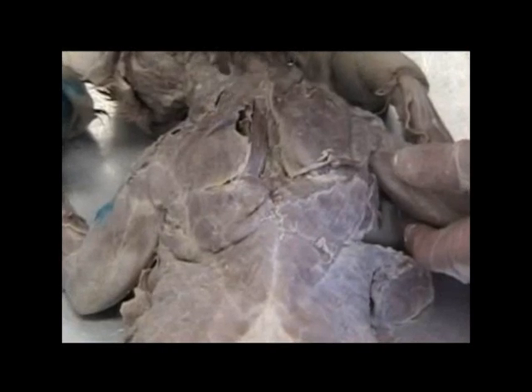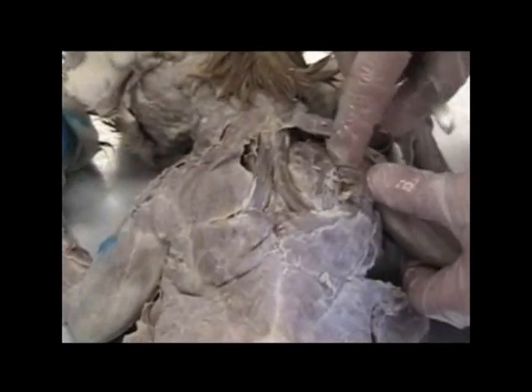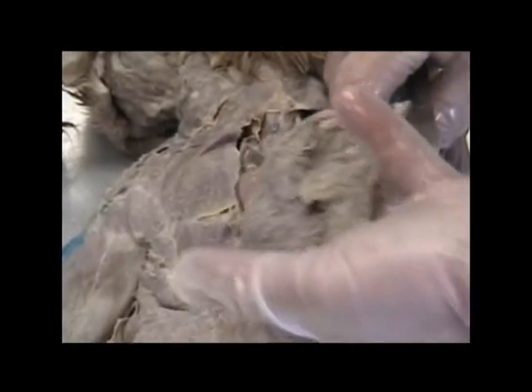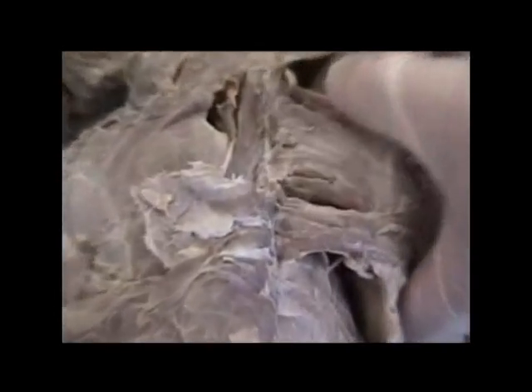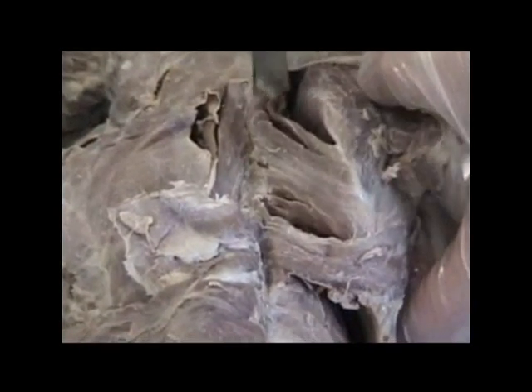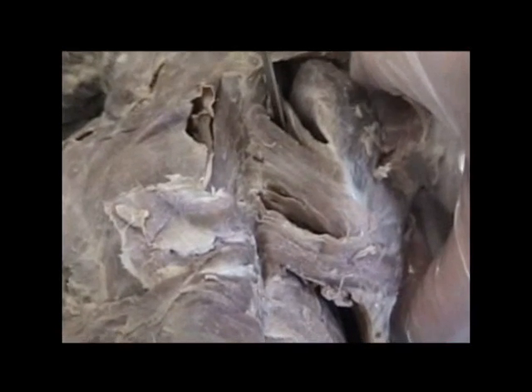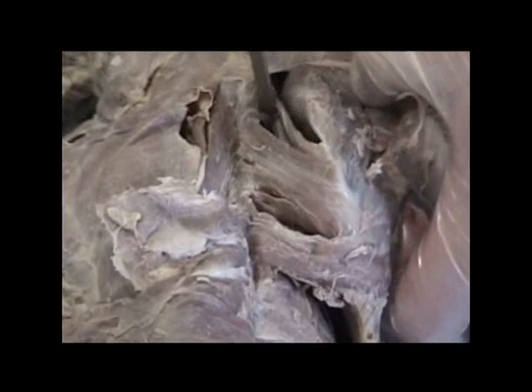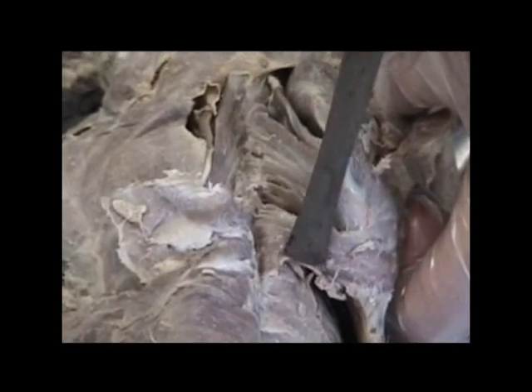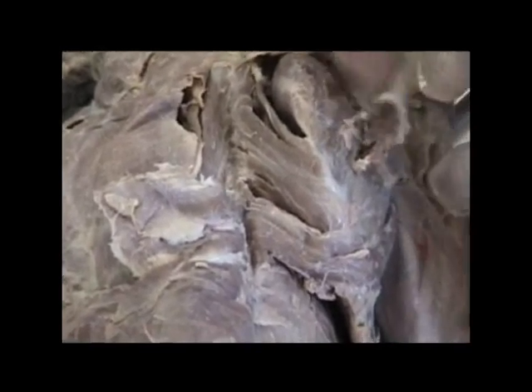I'm going to move to the deep shoulder, and we're going to reflect back the acromiotrapezius as well as the spinotrapezius and latissimus dorsi. And we can now see a distinct group of muscles called the rhomboid group, or the rhomboideus. And there are three divisions of the rhomboid. The most superior is the rhomboideus capitis. You see that's kind of loose. Then the rhomboideus minor and the rhomboideus major group that wraps around the posterior border of the scapula.